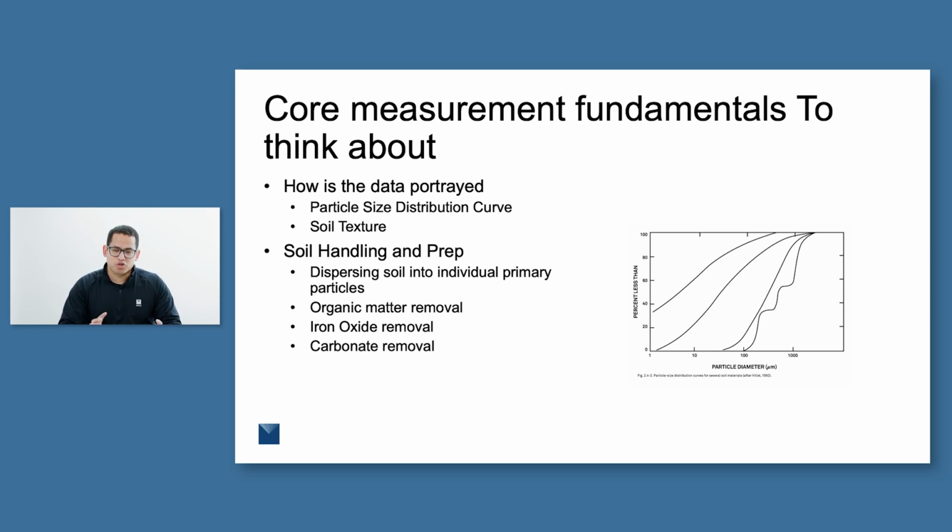Of course, just basic soil texture is super simple and really easy to portray, but there are some components that you can get out of the particle size distribution curve that are helpful when understanding what the actual breakdown of the sand, silt, and clay fraction is, and as those sizes change, what that actually might mean in terms of some of these soil mechanics and the behavior that you're going to see in terms of hydraulic properties and all of these things that you might see in soil.